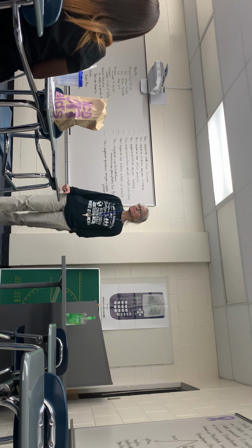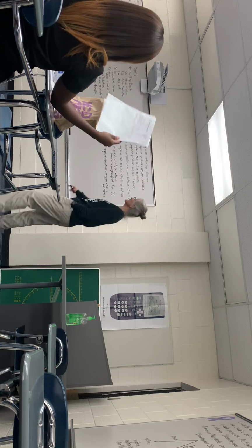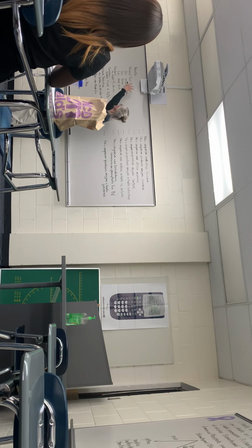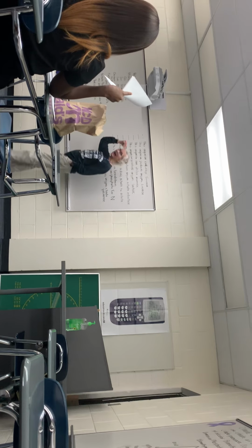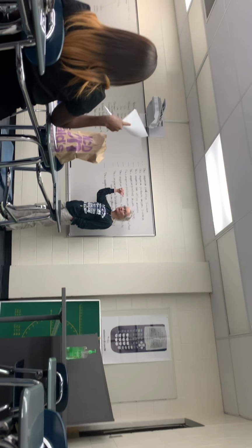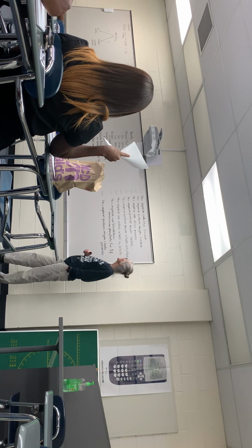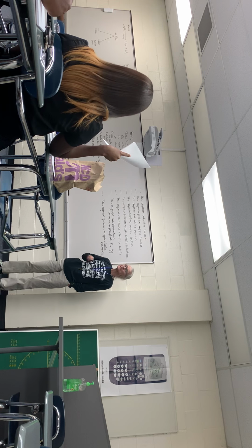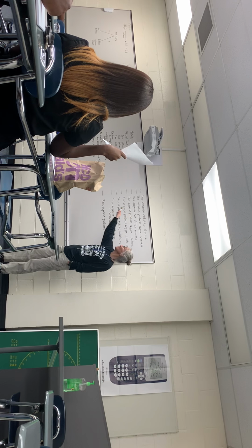No, these are your test results right here. Oh, okay. So these are your test results. So this is what we're looking at to identify these as acceptable, unacceptable, or can't be determined. So this organism can utilize sucrose. Is there anything there that tells me this organism can utilize sucrose?